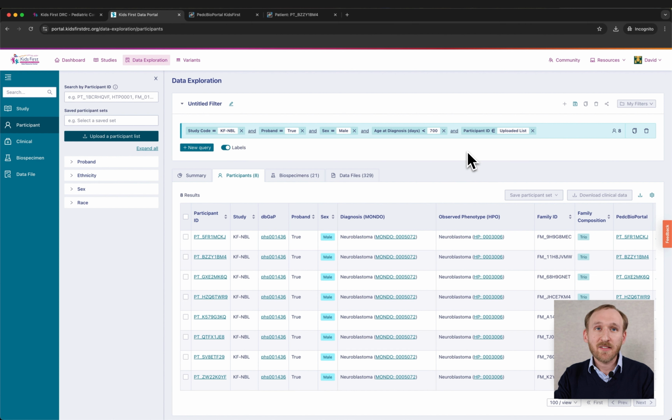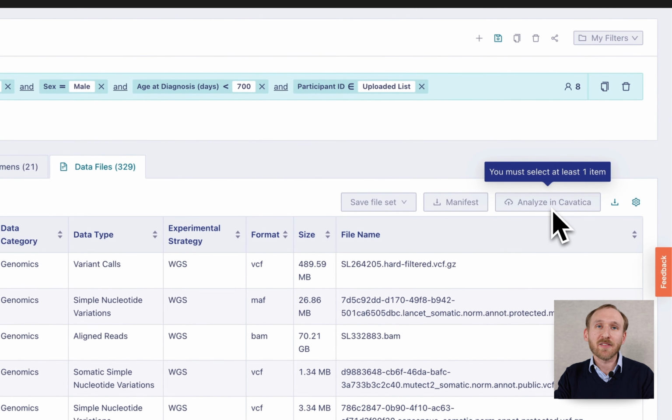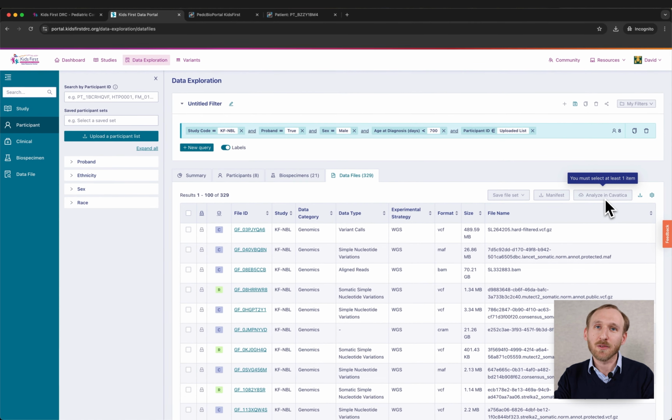From here, you can access data files for your cohort of participants to learn other information about them. You could then export the files into Cavatica for further analysis. Be sure to watch the fourth video in our support video series for more instructions about using Cavatica.